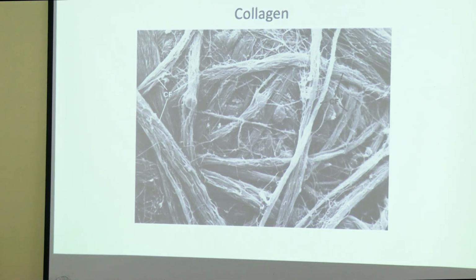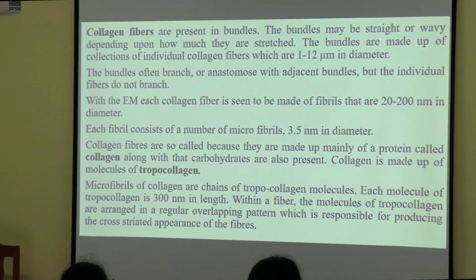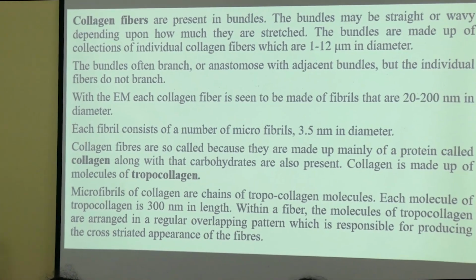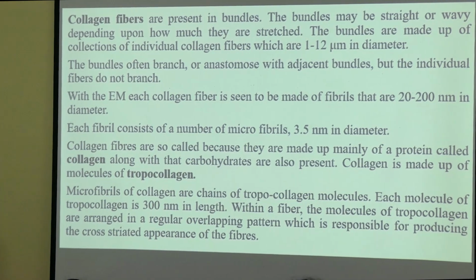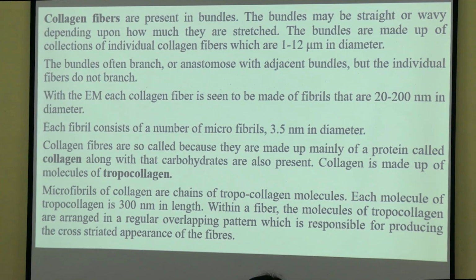So in fibers, what we have to study are the characteristics of the fibers, meaning where these fibers are present and mainly what the function of these particular fibers is. So we'll start with the collagen fibers. Please keep in mind, the collagen fibers always run in bundles. Whatever collagen fibers are there in any part of our body, they always run in bundles, not as a single fiber. Many fibers make a bundle and those bundles run.